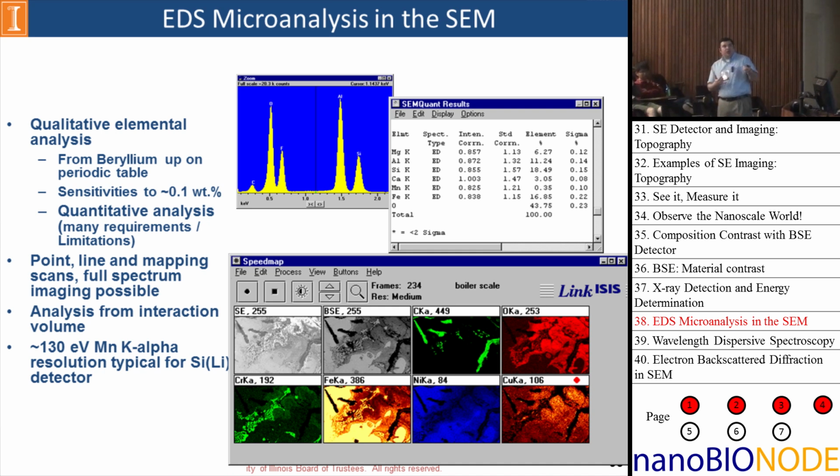Particularly, backscatter and the elemental analysis is very powerful because the backscatter shows you in your electron beam image kind of what it looks like, and then we can overlap these individual elements on top of the picture itself, and you can have a very good representation of where the signal is coming from in your sample. That analysis, of course, is throughout the entire interaction volume, so you have to be a little bit careful about buried structures or heterogeneous structures.